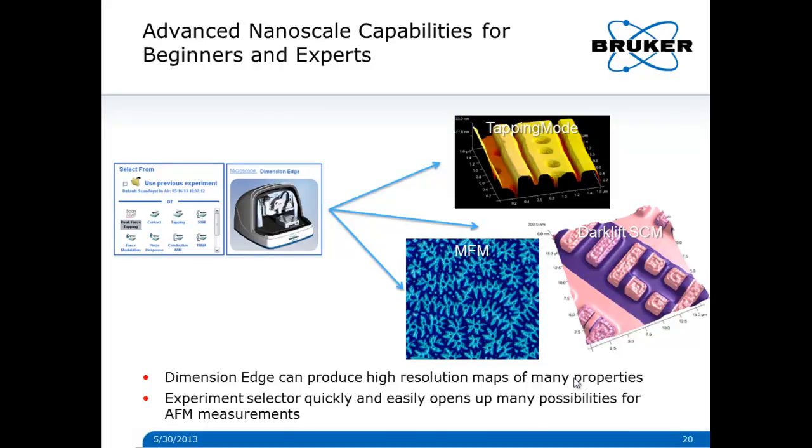Now, we've been talking mainly about PeakForce tapping, but I want to remind you that the Edge can do a lot of other modes. The experiment selector that you access when you're first entering the software allows you to quickly and easily open up all kinds of possibilities for SPM experiments. For example, you can do tapping mode, so you get a height map.